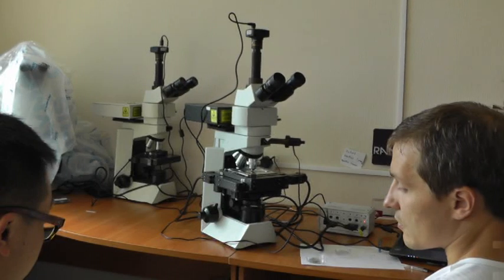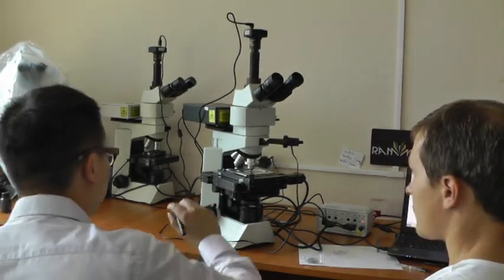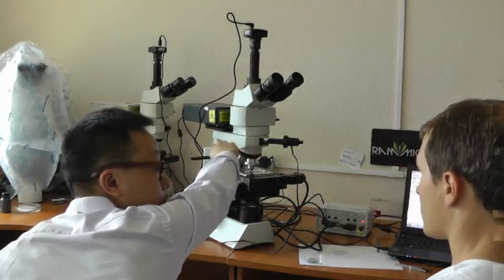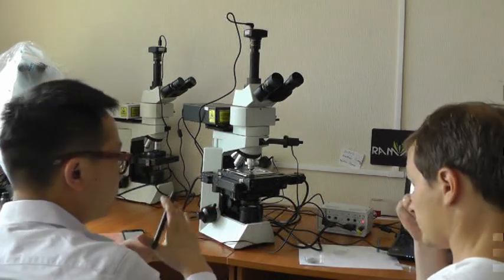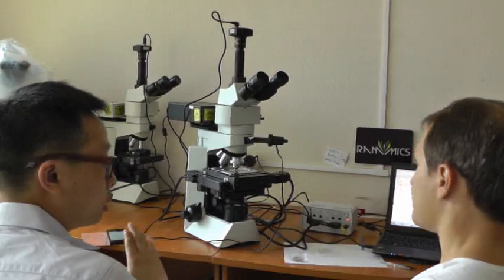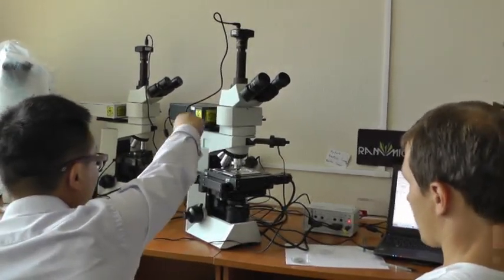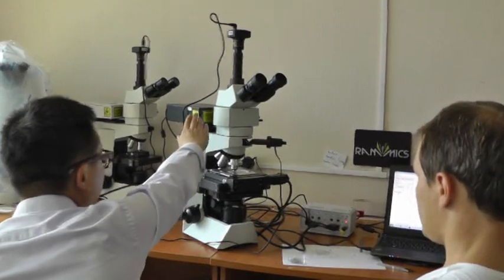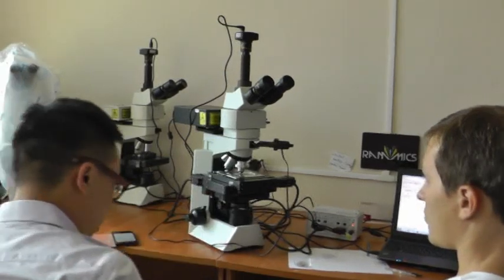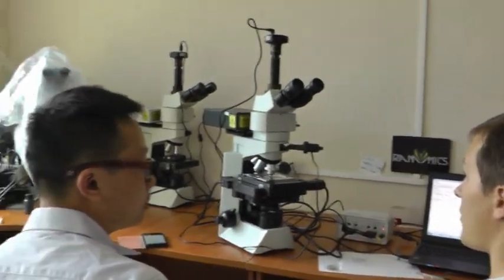The last time we went to a metallographical microscope, it has some setting at this point, and the beam splitter cannot be removed. Cannot be removed? Yes, cannot be removed. So if we add the Raman spectrometer here, the laser would have to cross the beam splitter.